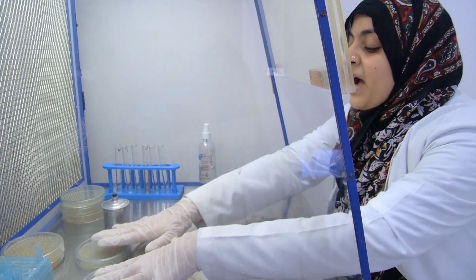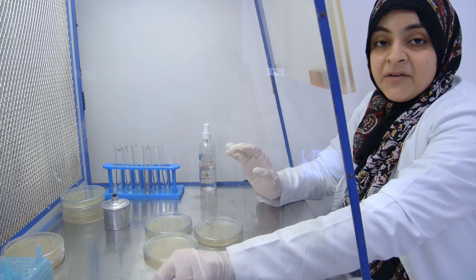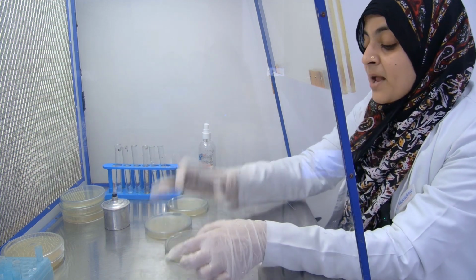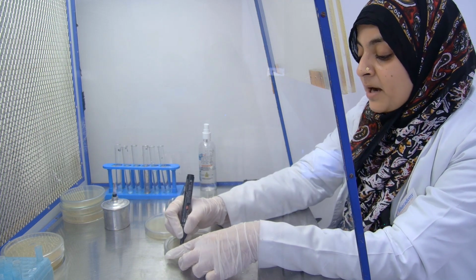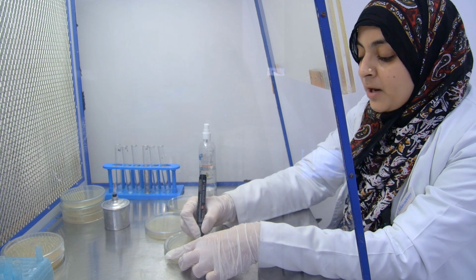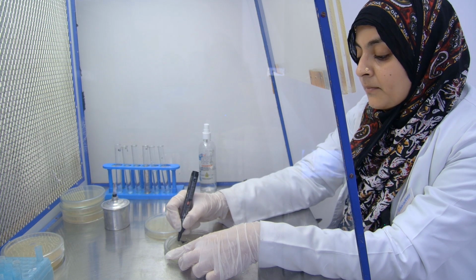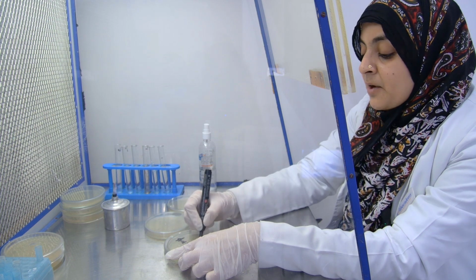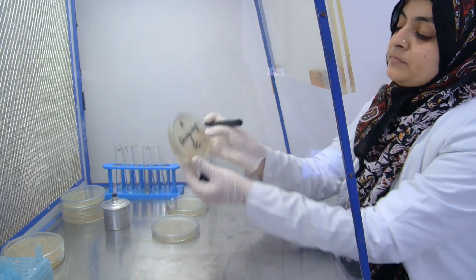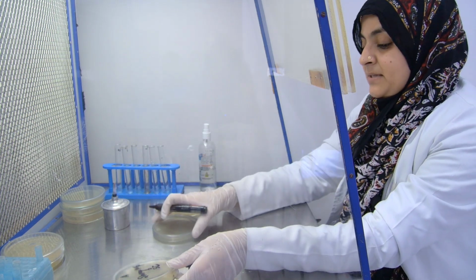Now today what we have to do, we have 3 Petri plates, in which we have already poured the nutrient agar media. On the first plate we put A, and also write down the storage temperature, that is 5 degrees Celsius. See, A plate, storage temperature 5 degrees Celsius.